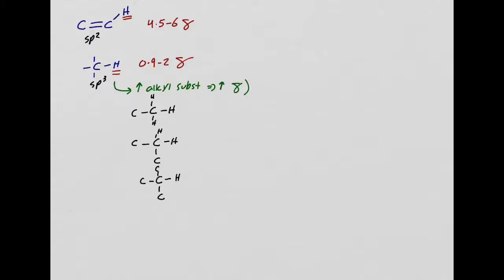Here's what I'm trying to show you here. Okay, so let's look at this one right here. First of all these hydrogen, this one, and this one, they are going to have one signal. Do you guys agree? All of these are going to have one signal because they're all equivalent to each other. I have one set of unique hydrogens. Okay. Now, this is most likely are going to show up around 0.9 ppm.